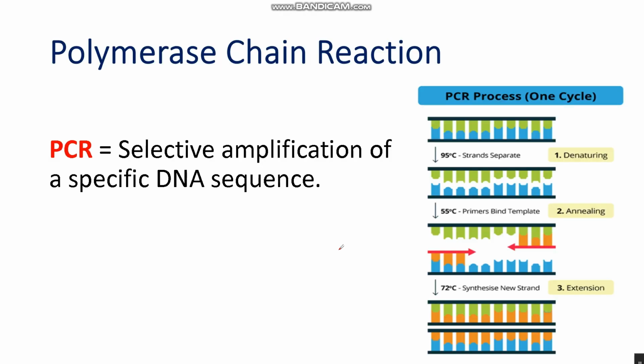So, what is PCR? PCR is the polymerase chain reaction.